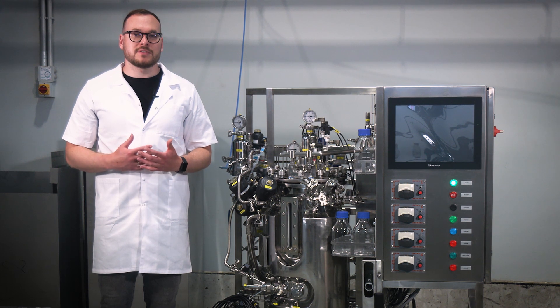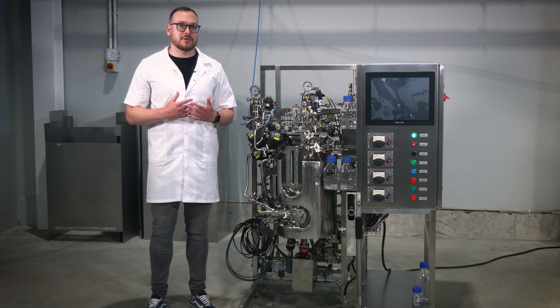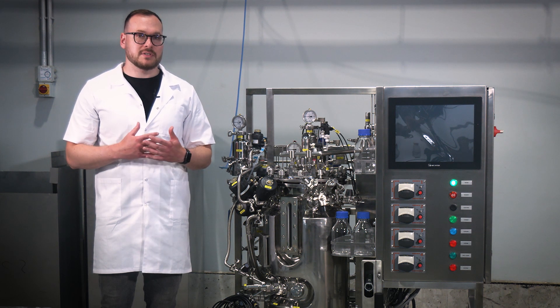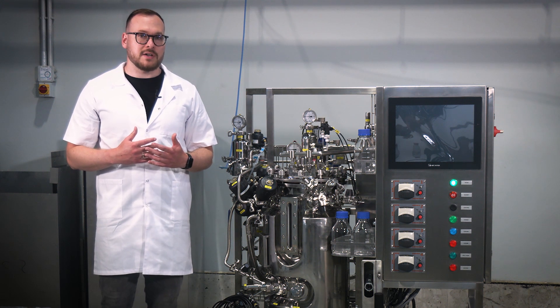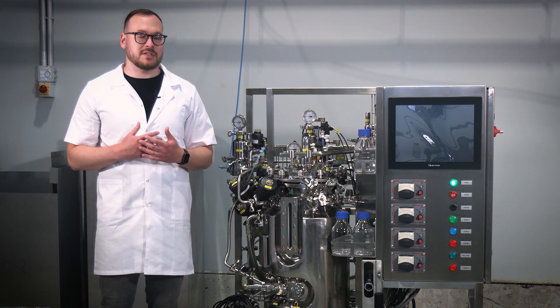Next, let's move on to the power setup. Step 13. Before proceeding, ensure that the power switch of the control cabinet is in the off position. Connect the power cord to the power supply. Please note that the standard set for the stainless steel bioreactor includes a built-in uninterruptible power source. In the event of a power supply interruption, the UPS can sustain the operation of the control cabinet for up to 15 minutes, ensuring continuous online data storage in the database.